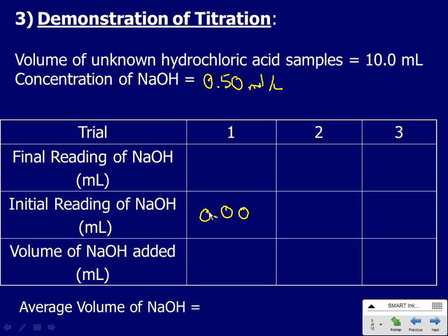Okay, so now I'm ready to titrate. You always want the tip to be below the Erlenmeyer flask, because if you've got the tip above, as you're looking, you could inadvertently take it out from underneath. If it doesn't land in the Erlenmeyer flask, the titration's no good. You've got to start all over again, because now we want everything that we have measured going into there. It's all about accurate measurement.